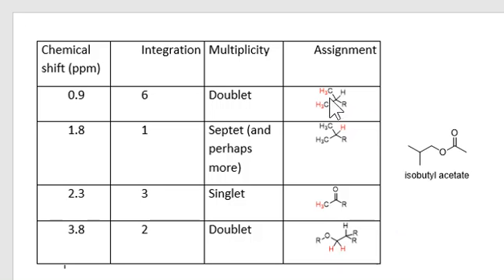We know, stepping one step and then the next step, that the 2 methyl groups are bonded to the hydrogen. And now we can bring in this final signal down here. If you have 1 hydrogen in those 2 R groups, and those are the 2 R groups there, then that's bonded to a carbon bonded to 2 hydrogens.